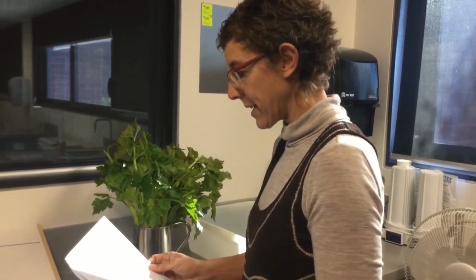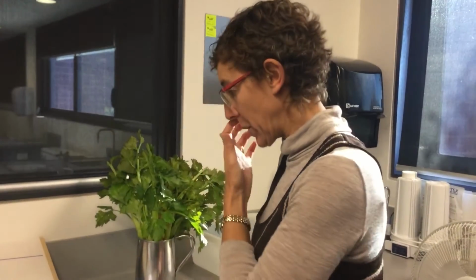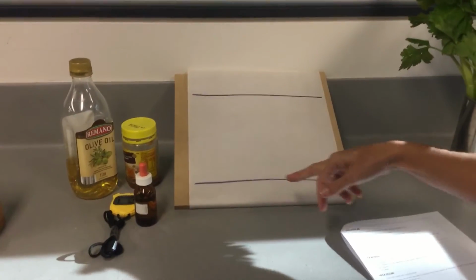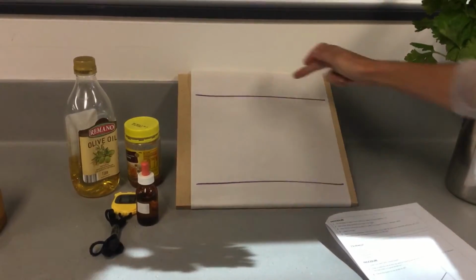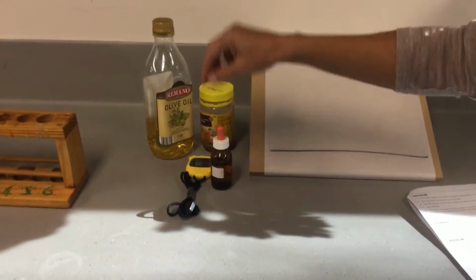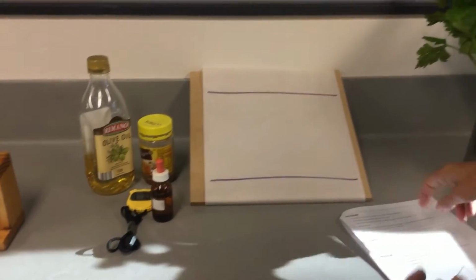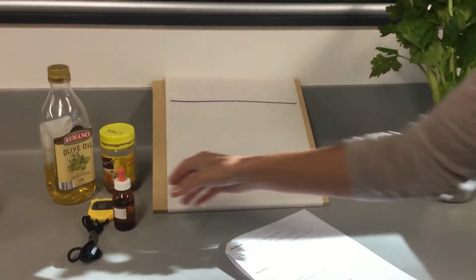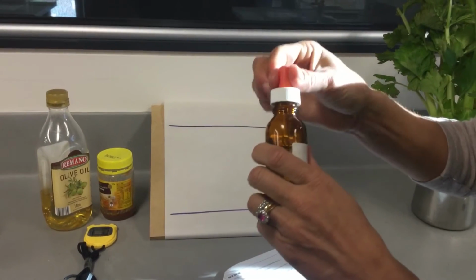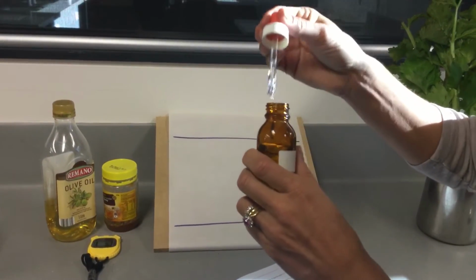Okay, number 4, that is number 4. Number 5 uses this apparatus here with a piece of wax paper. We've drawn 2 lines, and what we're going to time is how long the drop of honey or oil or glycerol or water, or there's a number of substances that are outlined on your sheet, takes to get between the 2 lines.